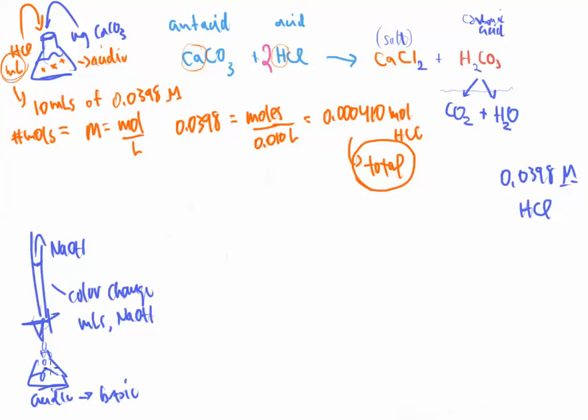The purpose of me doing that is to figure out how much acid was left over. That is why I titrated it. I knew that I slammed it full of extra acid. It neutralized all of what it could.